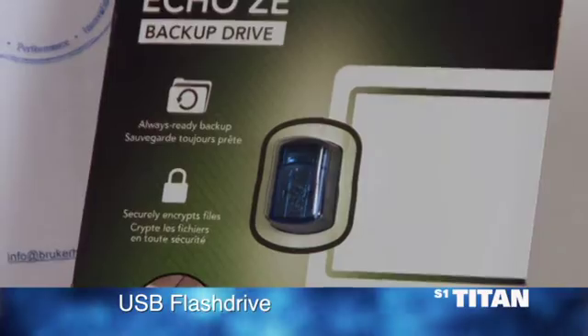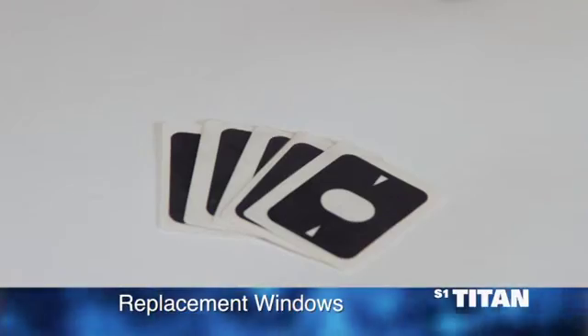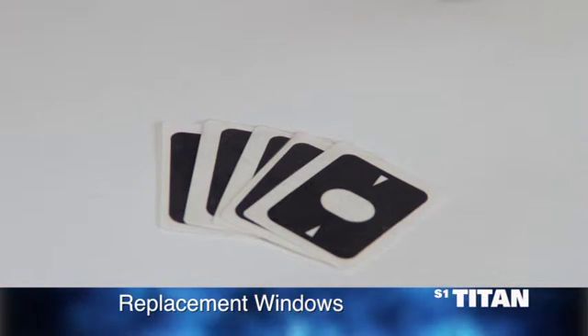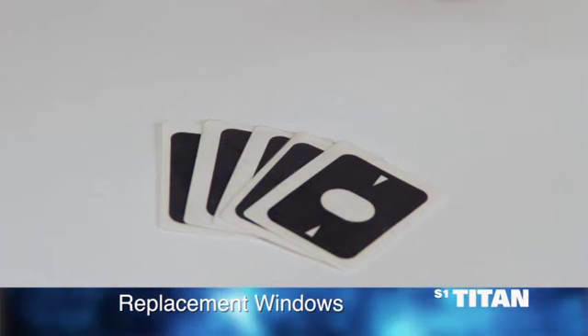A USB flash drive, which is used to transfer data from the analyzer to a PC. A kit of five replacement windows for the analyzer. These protect the analyzer from dirt and contamination. Additional windows can be ordered from Bruker.